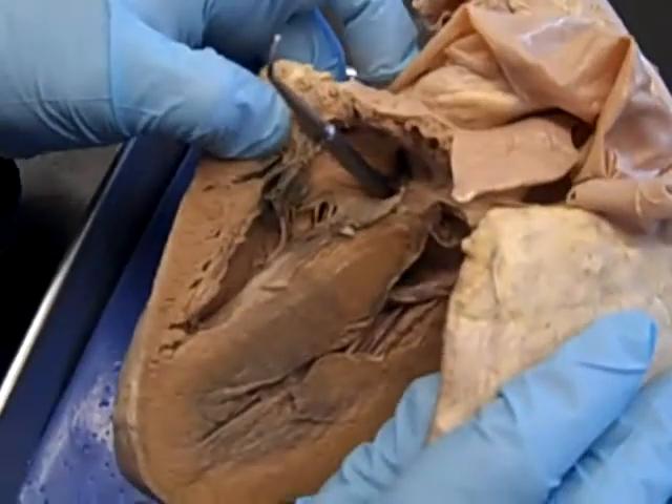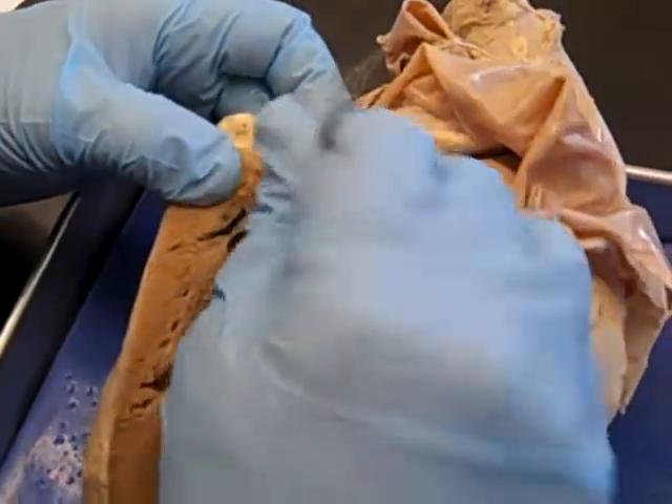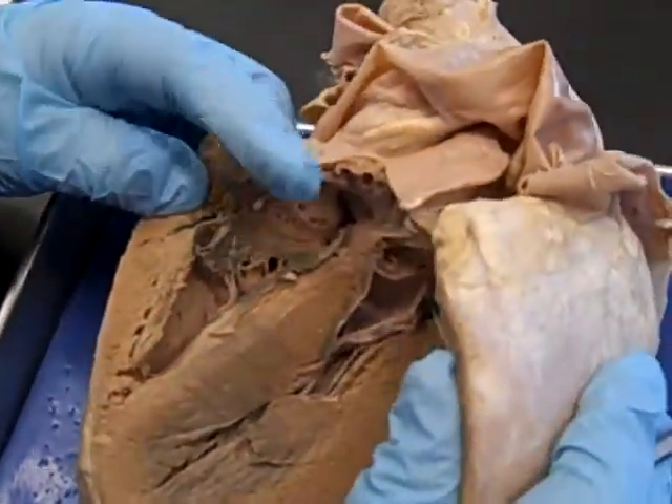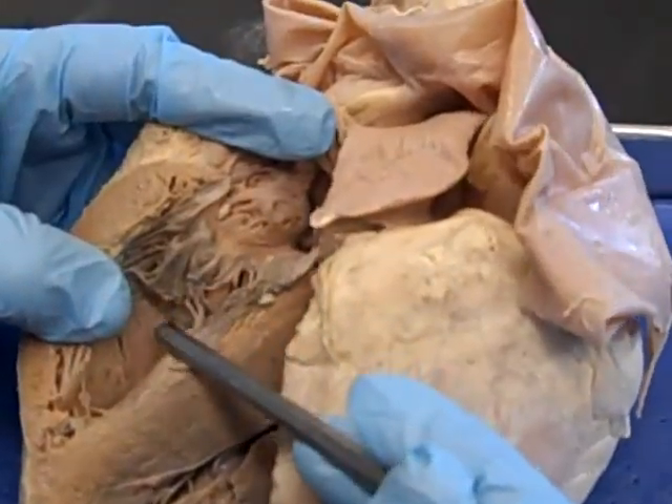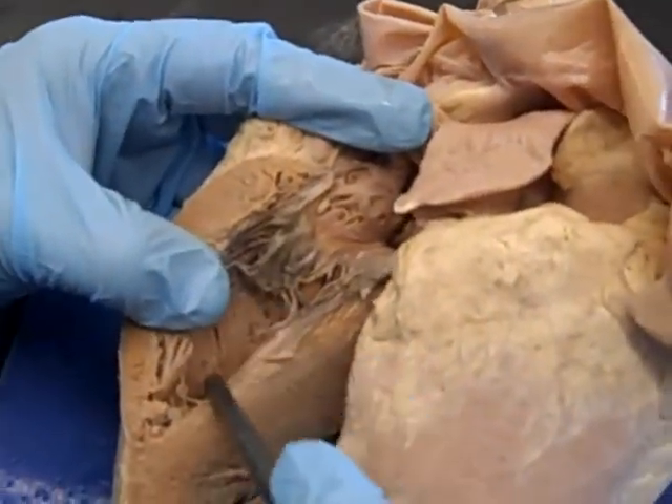There is a fossa ovalis, but I'll show you that on another heart because you can't really see it in this one. Blood comes into the right atrium and flows down over this valve into the right ventricle.